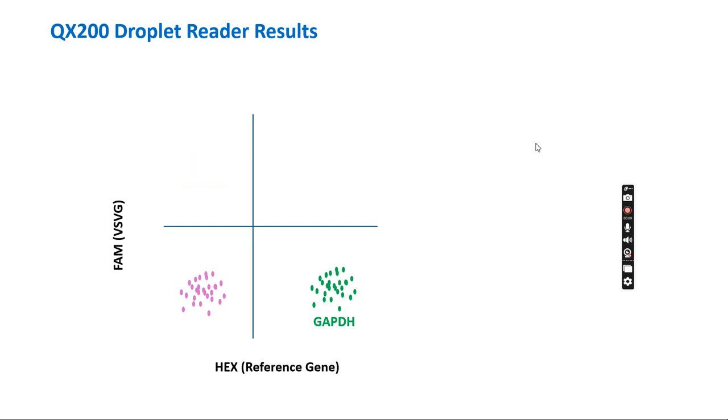So typically we should see this kind of result, and we should be happy if we see it. But if we see the VSVG in the results, that means our product is contaminated. We cannot release it, or give this product to our patients, which is very, very dangerous.